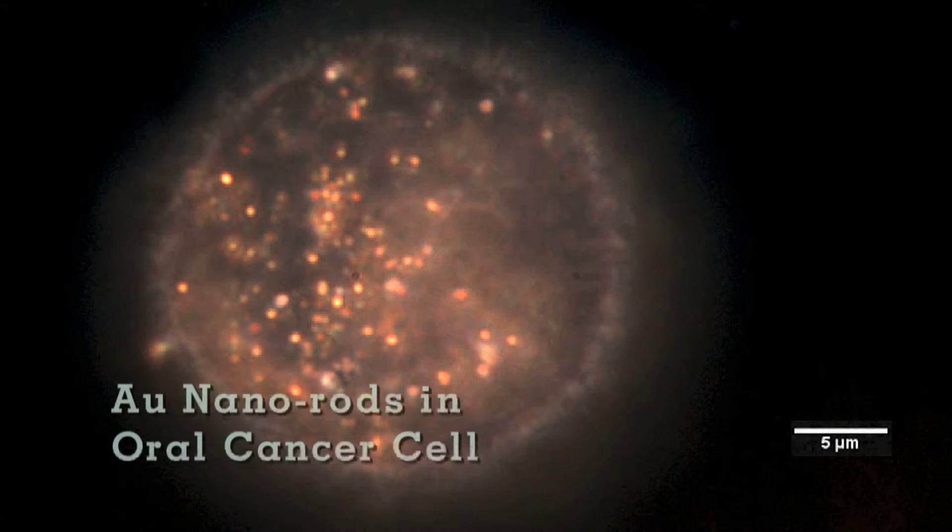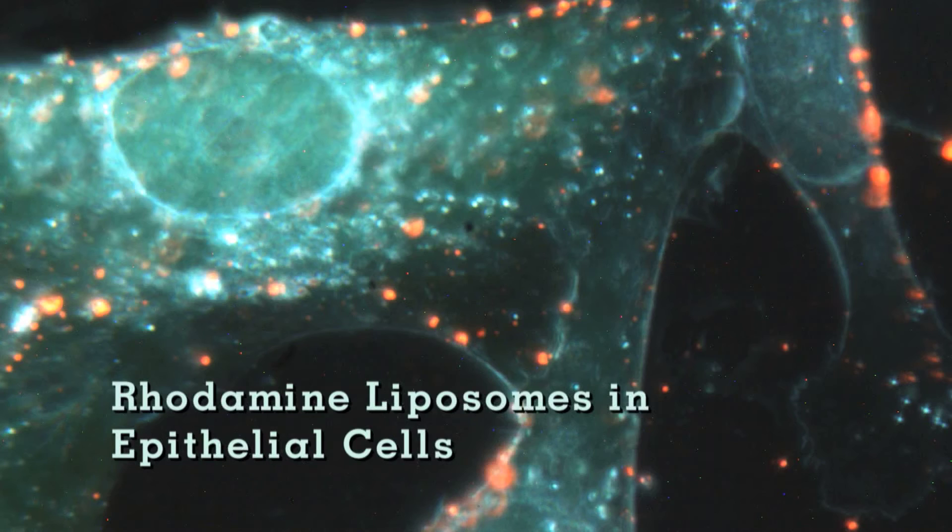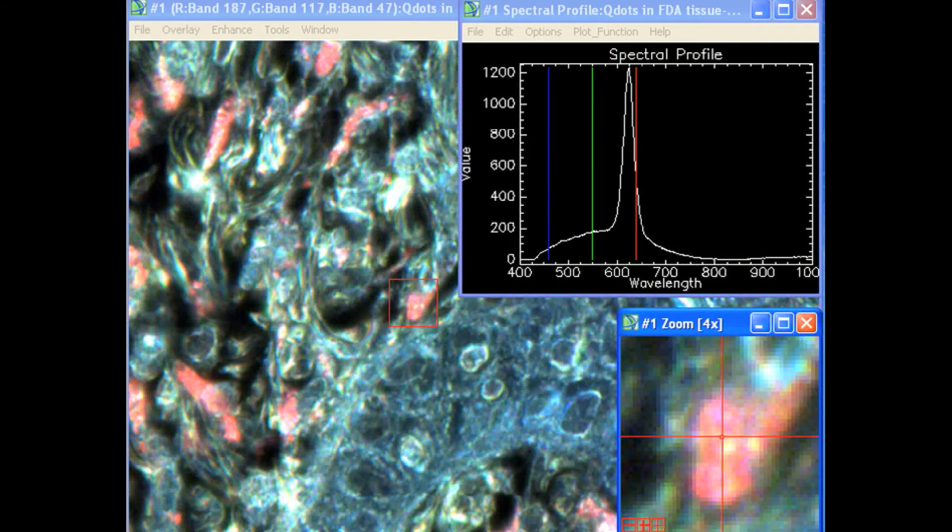Integrating hyperspectral imaging with the CytoViva-equipped microscope enables spectral characterization of nanoscale materials and biologicals. This characterization is accomplished by capturing visible near-infrared reflectance spectrum from the sample at very high spectral resolution.